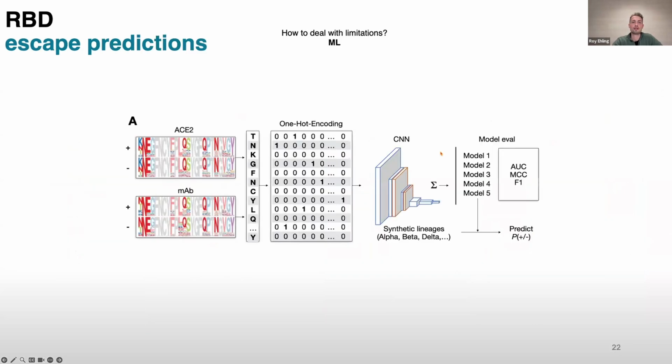Now, a lot of these trends are really tough to interpret. We generate one of these plots for every single clonotype library, and there are over 30. So it's really tough just visually to inspect this. So we thought we need to apply machine learning to not only make the analysis easier, but also to be able to go beyond things that we can find in the data and have a more thoroughly probed sequence space.